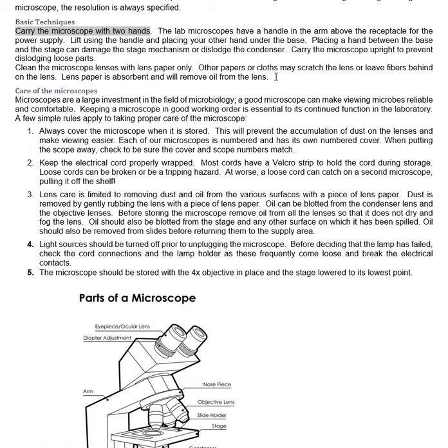And by the way, just as an aside, the only lens you can use with oil is the 100X. It's sealed so that the oil won't get inside and permanently fog up those extraordinarily expensive ground lenses. So that means once you put oil on a slide, you do not go back down. You have to stay on the 100. And that's going to be important when I tell you exactly the procedure for getting a good view through a microscope.